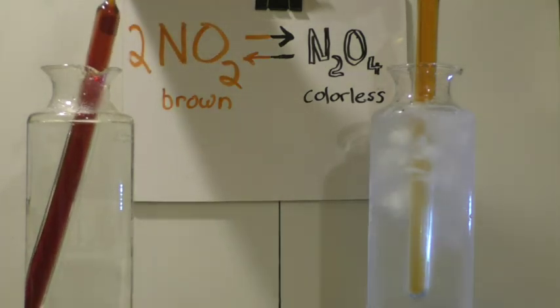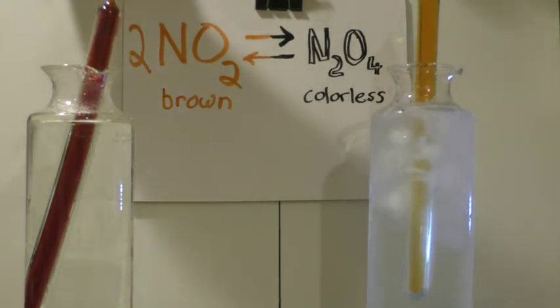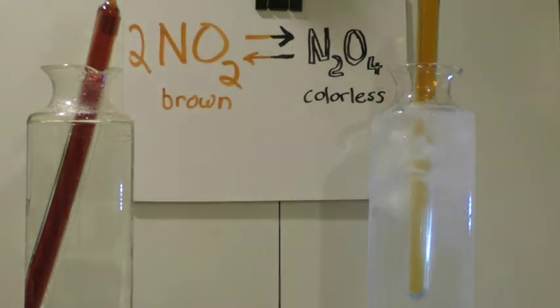Same thing over here. It's much easier to think about this one and say that both reactants and products are present because I can compare it to this one. But they're both at equilibrium. The rates are the same, but the proportions of the reactants and products are different. And it's those different proportions that exist at different temperatures or under different types of conditions that we call a position of equilibrium.